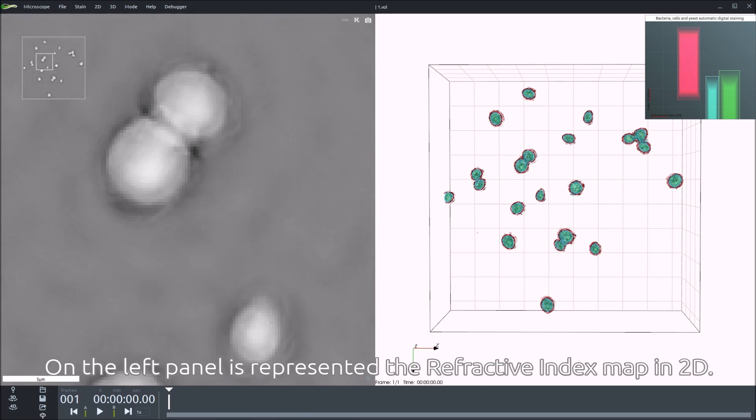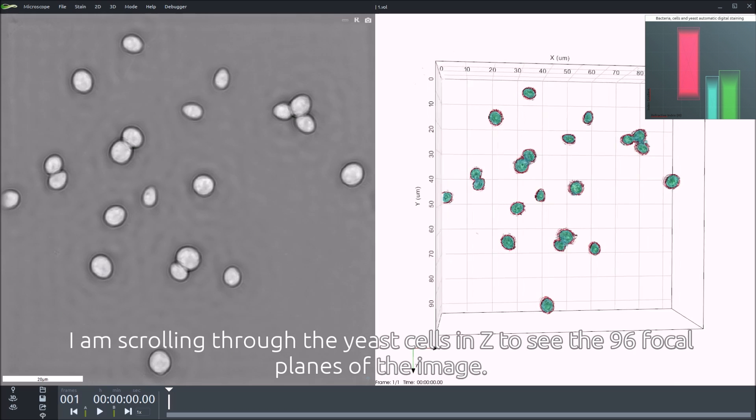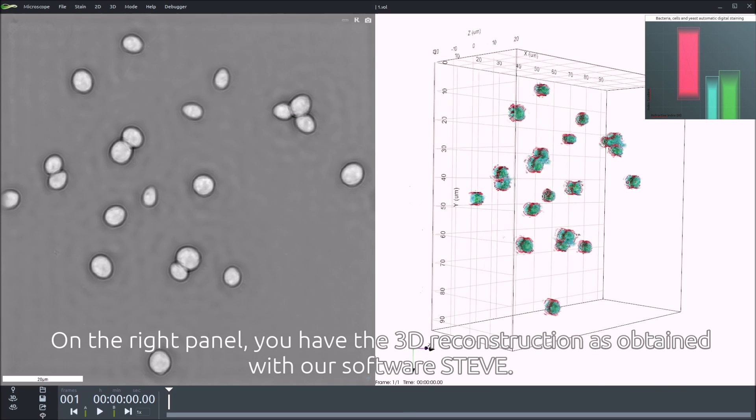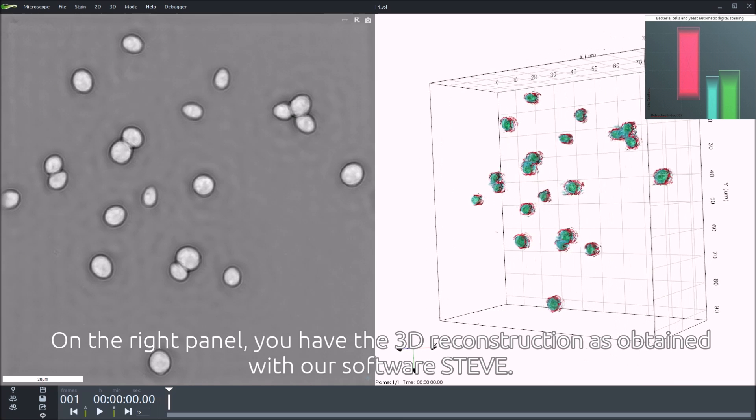On the left panel is represented the refractive index map in two dimensions. I'm scrolling through the yeast cell in Z to see the 96 focal planes of the image. On the right panel, we have the 3D reconstruction as obtained with our software Steve.